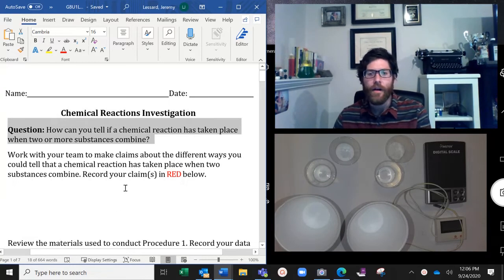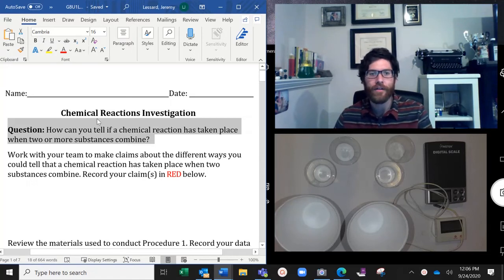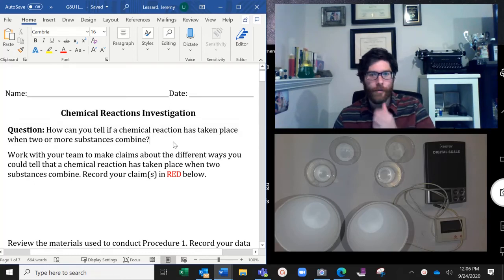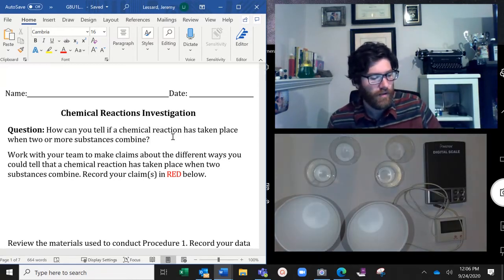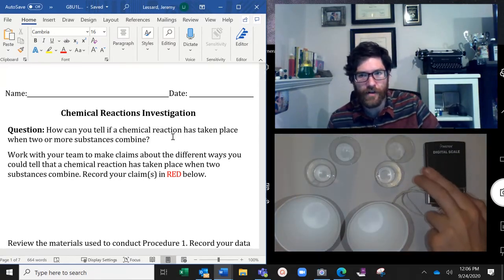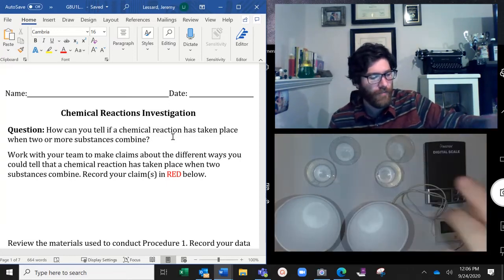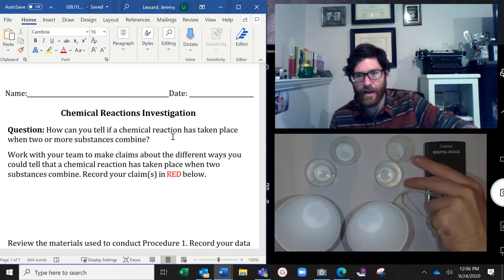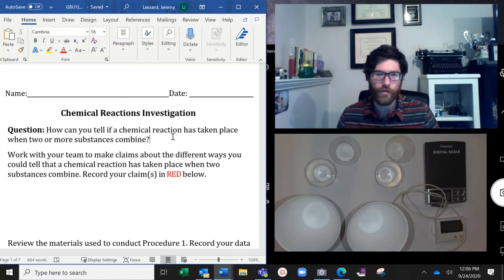Okay, so after you watch this intro video, you're going to record at least 2 claims about how you can tell if a chemical reaction has taken place. And so what this lab is going to be doing, we're going to be mixing 2 chemicals together. All right, we have 2 different sets. We're going to be doing it twice. We have one that's baking soda and vinegar, and one that's potassium iodide and hydrogen peroxide. Okay, and we'll look at what those are.